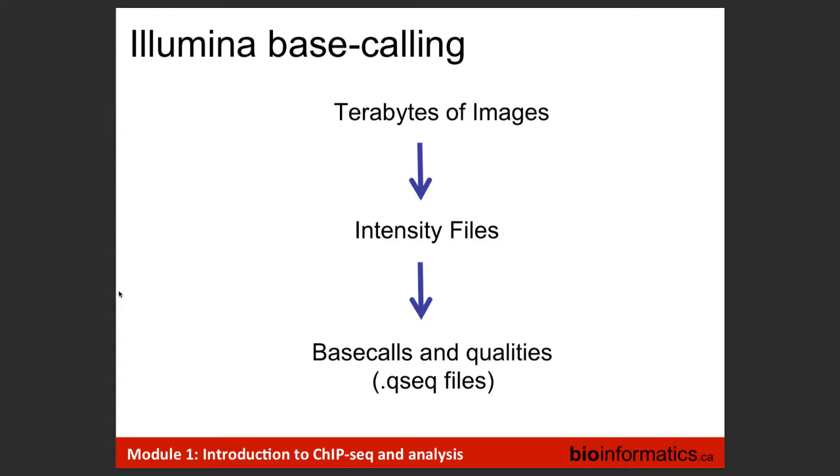So we start with the images, and as Guillaume just mentioned, the images are now deleted in real time. When NGS first started, we kept the images. Some of us might remember those days. We used to have a little tiny compute cluster, a three-node cluster, sitting underneath the sequencer, and the lore is, and this is what I heard, that it was a co-op student at Illumina who came up with the algorithm that does so-called real-time analysis, where the images are converted in real time to generate the sequences and then are dumped.